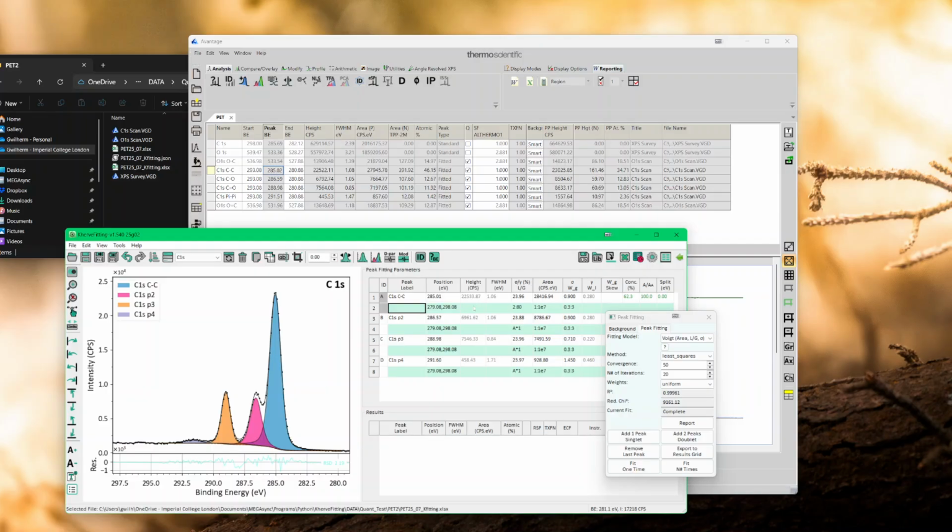So now what we can check is first our CC peak, and we'll use this as our witness. The CC peak we get is 22533, and what we get here is 22522, which is a pretty good comparison. So it's almost the same.